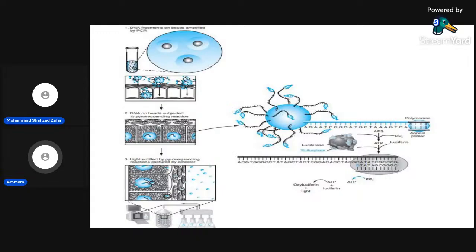So your detector will capture those peaks, and you can analyze the sequence of your DNA. Next slide.